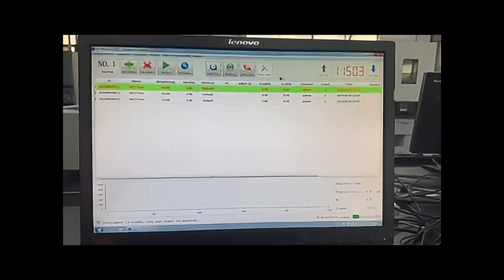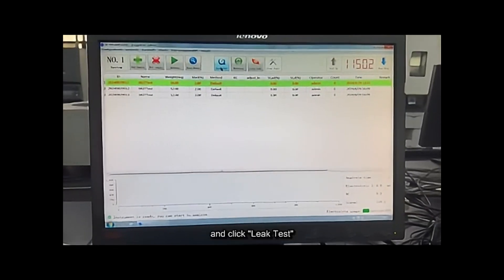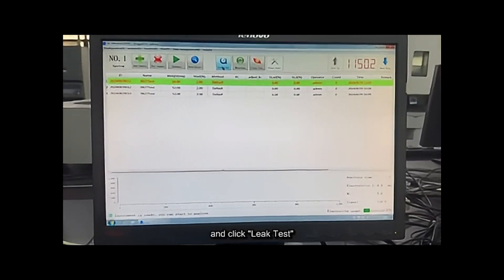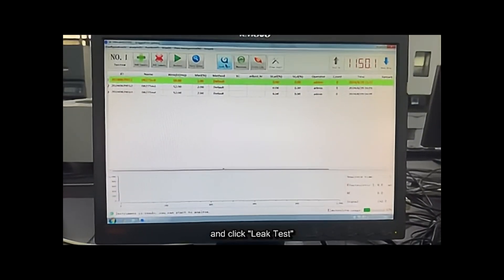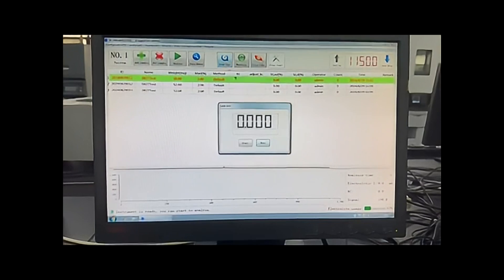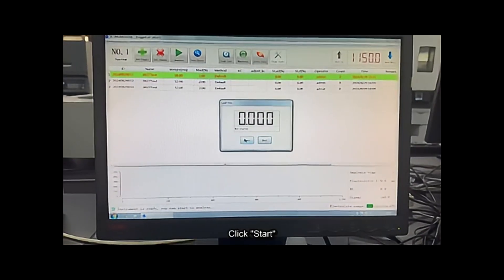Open the software and click leak test, start.